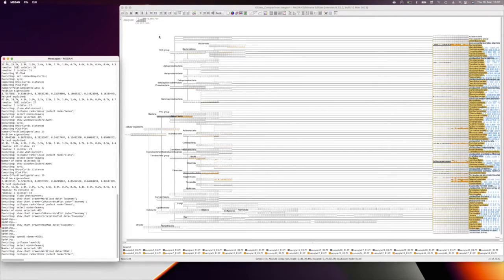For graphical analyses, this is maybe not so useful. The case that I could see for graphical analyses is if you want to exclude a lot of taxa for one of your plots for whatever reasons, and you want to do that for each of your data sets.